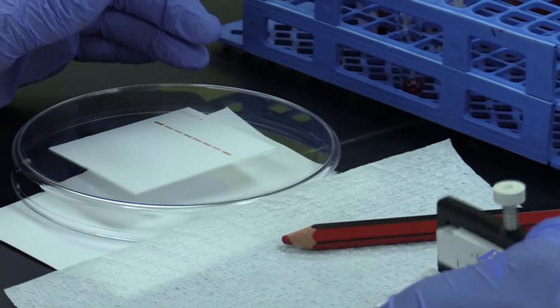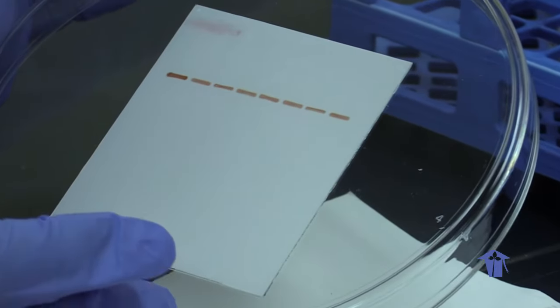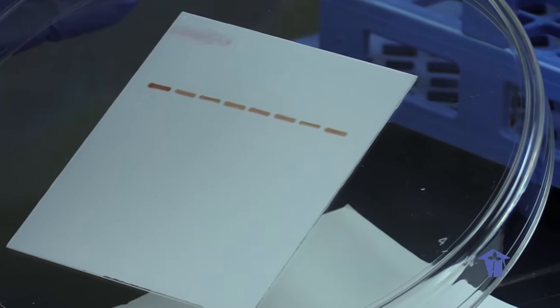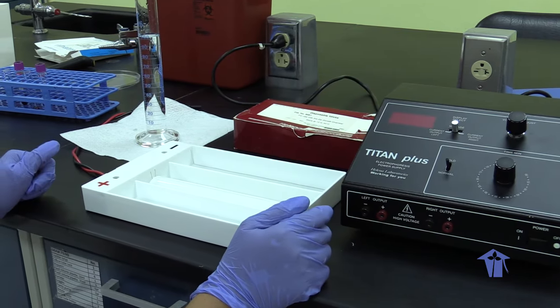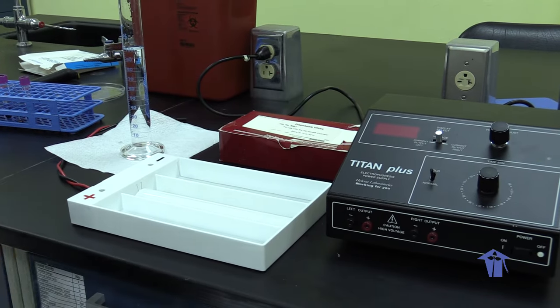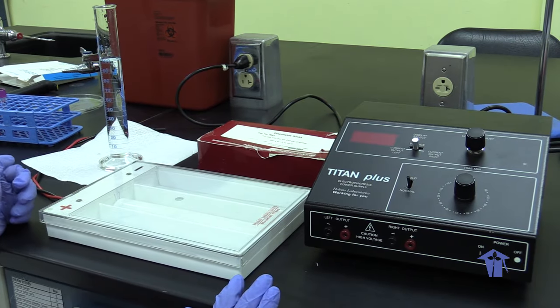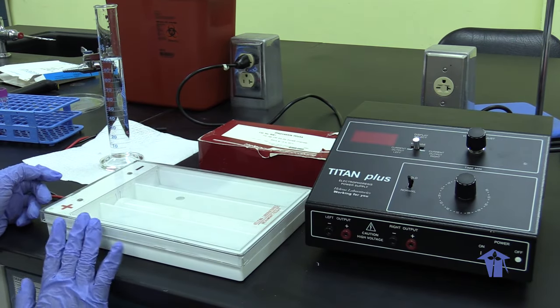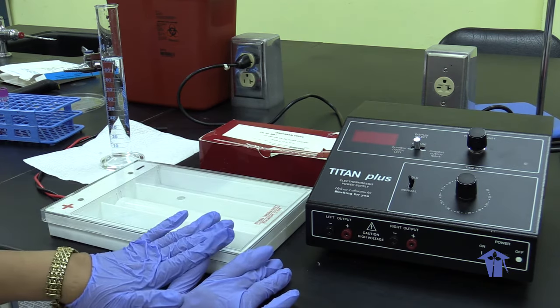So this is what it should look like. Good. So class, we're going to prepare the electrophoresis chamber. So this is it here. This is the preparation of the electrophoresis chamber. One of the things I want to emphasize is the actual removal of the cover.